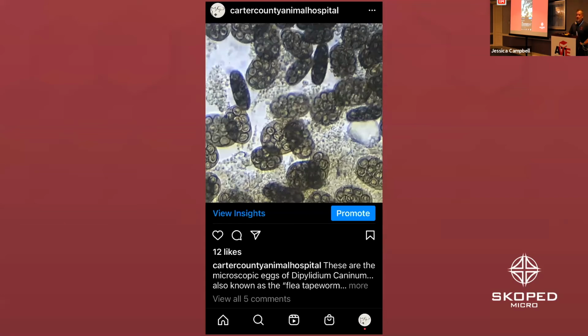Has it helped me? Has it helped the pets that I work on? Because I'll have a slide like this. I'm like, okay, let's have a talk about Dipylidium tapeworms. And I'll gather the picture I like. I usually do a 10-second video, and then I can come back and pick the perfect picture I like, screenshot it, do a little blip about what we're looking at, how it comes about, where they got them, and what we need to do. And then invariably, within a couple of days, 5 people come in with that. They may have eventually come in anyway, but that pet would have been sicker.